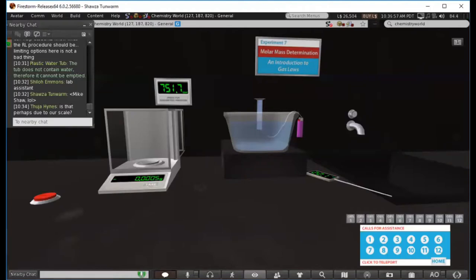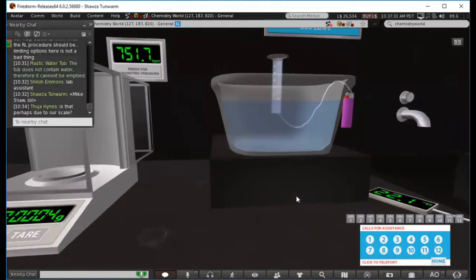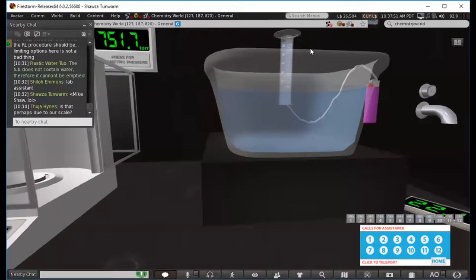The idea here is that you have butane gas in the lighter. You have tubing running from the lighter to a graduated cylinder that is filled with water, but upside down, so that when we click on the lighter, we can start the release of butane. After a minute or two, you can zoom in and see this in more detail, but once the lighter is opened, the butane gas is released, it goes through the tube, and it collects in the top of the graduated cylinder. We do that so that we can measure the volume of butane gas that is collected. Of course, as the gas collects in the graduated cylinder, it displaces water, and so the water is pushed out, and you can collect a volume of gas.